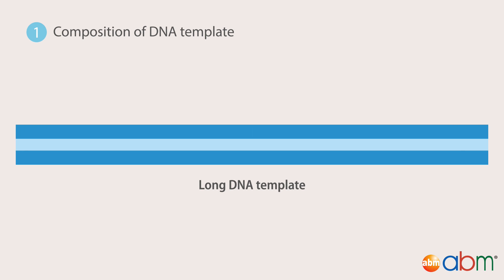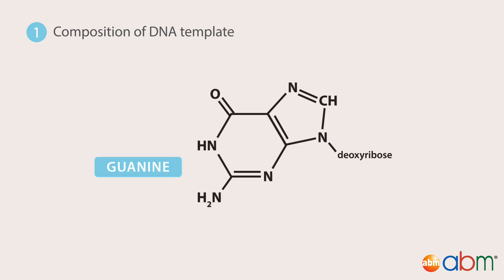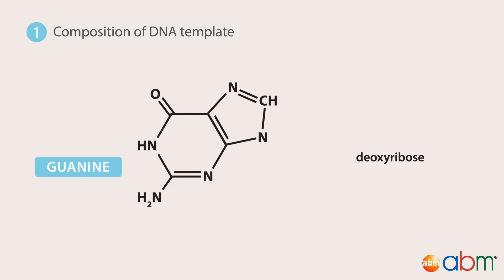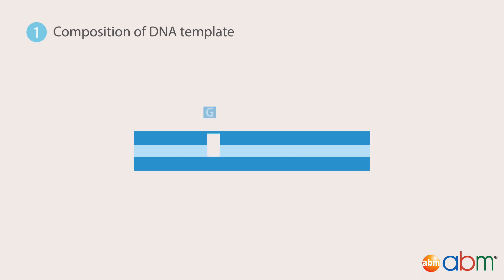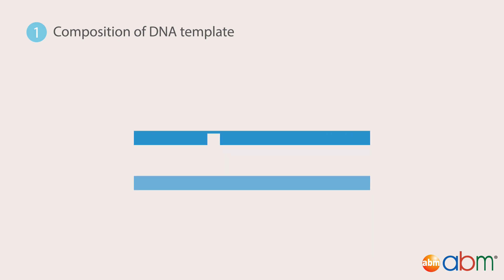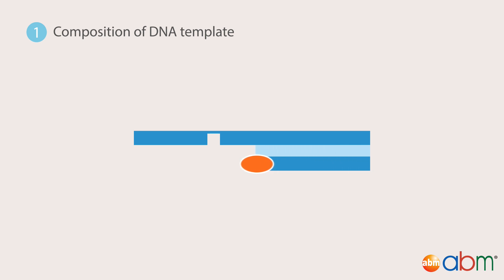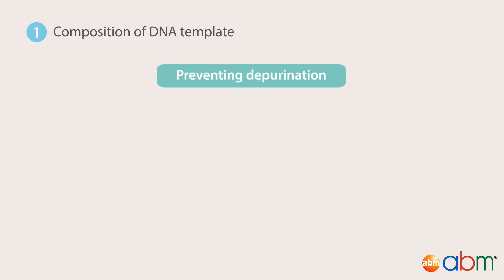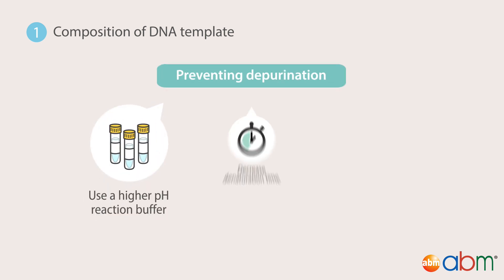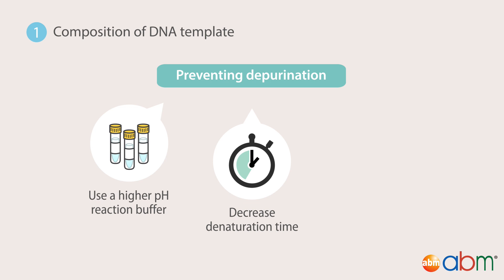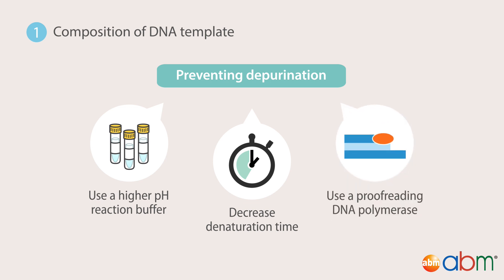Long templates are difficult to amplify because of their higher likelihood of DNA template being broken or degraded by depurination. Depurination refers to a chemical reaction during which the beta-N glycosidic bond in the purine nucleoside is cleaved to release a nucleotide base due to hydrolysis. As Taq DNA polymerase will not extend through apurinic positions during replication, depurination is an important limiting factor of long template amplification. This can be avoided by using a higher pH reaction buffer and decreasing the denaturation time, or by using a proofreading DNA polymerase.